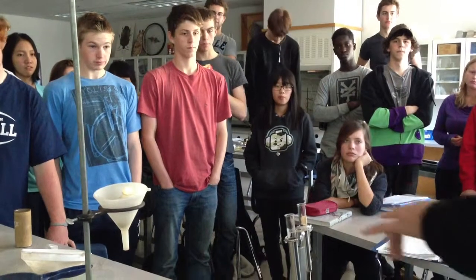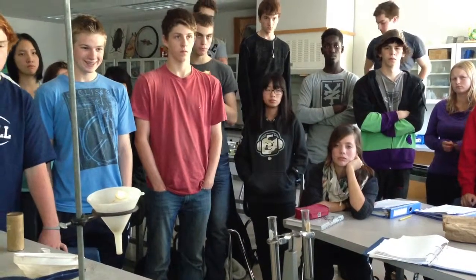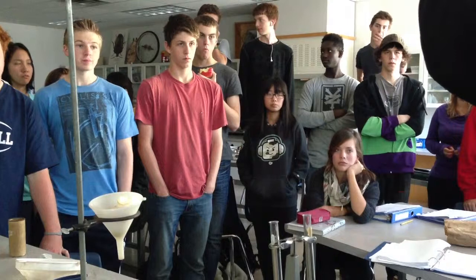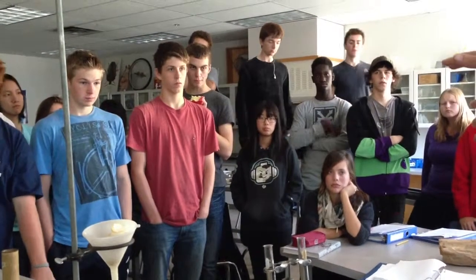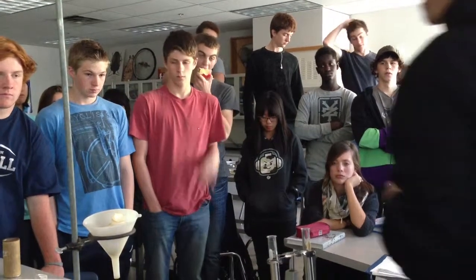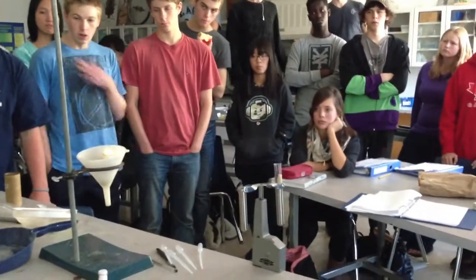We can do the same thing to help with this device here called a centrifuge, to help separate objects based on their densities. And so if I have two objects, one's really dense and one's less dense, and gravity's pulling on them, if they are allowed to flow, the more dense one is going to try to slide underneath the less dense one. Won't work if they can't flow, though. So if I wanted to separate different solids, like say some sand and rocks and flour, they don't flow so well.